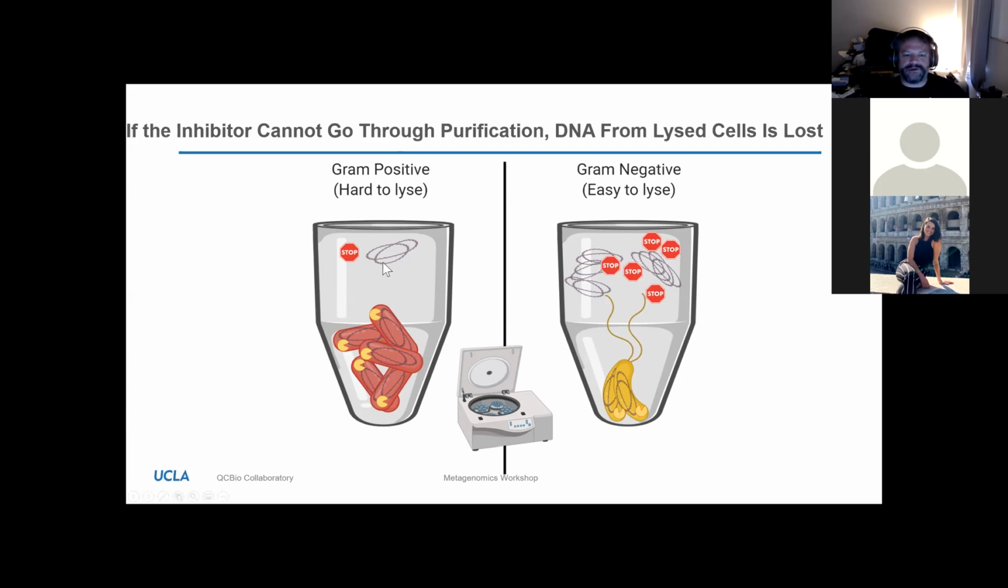The problem with that when you're doing a microbiome is if you have all this lysis happening and you have differential lysis, and RNA-later itself is also fairly lytic for bacteria. It'll pretty much kill everything, and it'll lyse especially gram negatives. That DNA goes into the solution, and even though the DNases are inhibited, you have to spin down the cells to wash off the inhibitor. And when you wash off the inhibitor, you're actually washing off also the DNA that went into solution there.